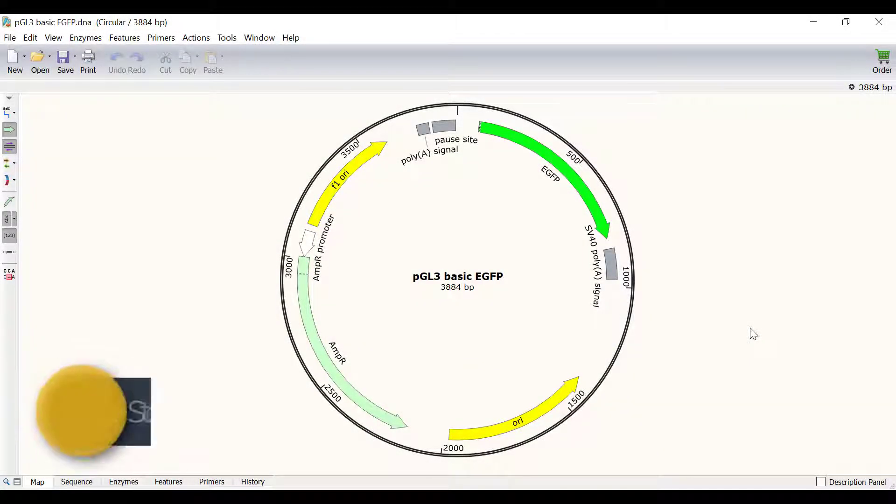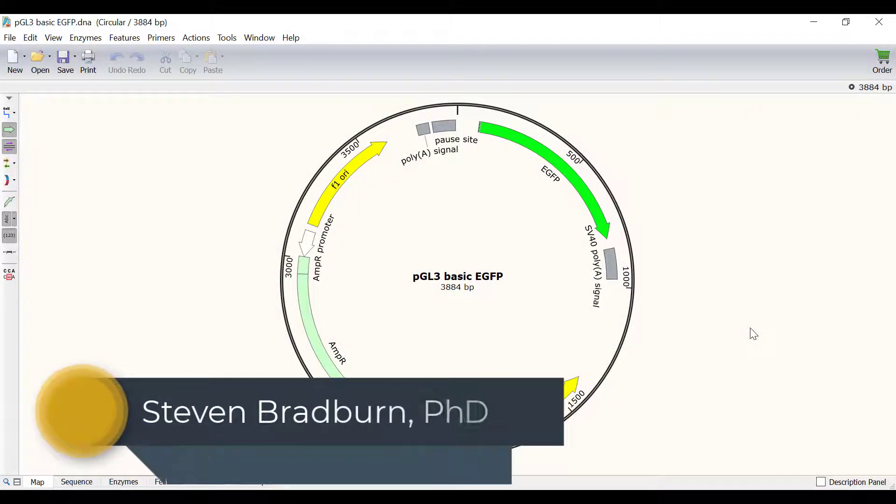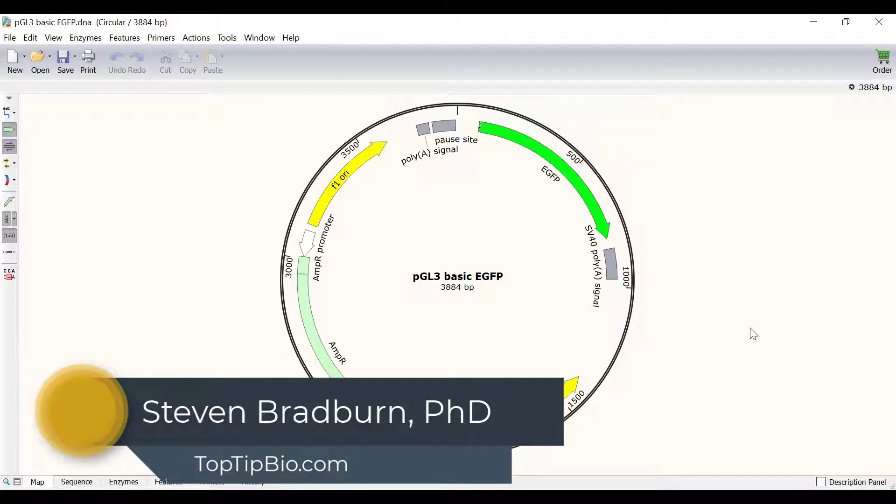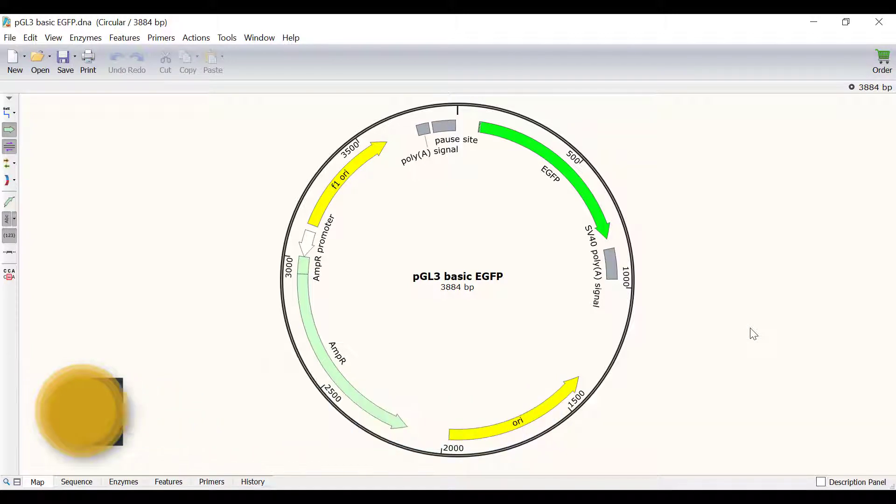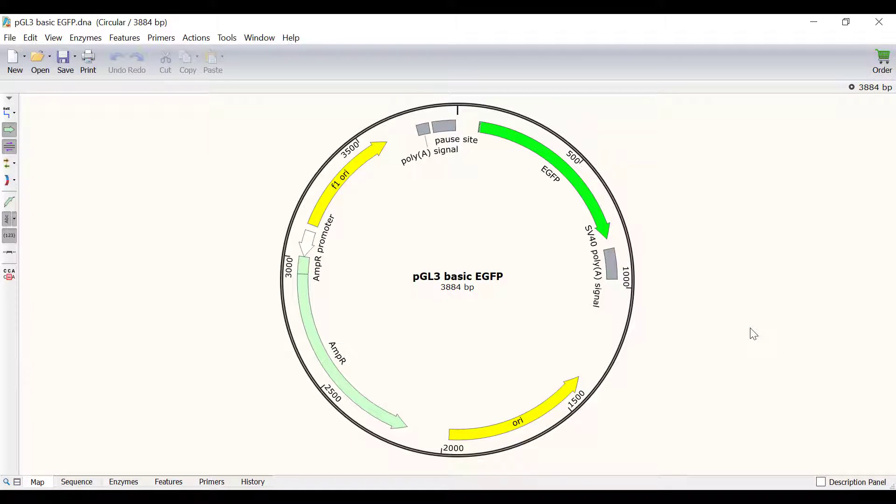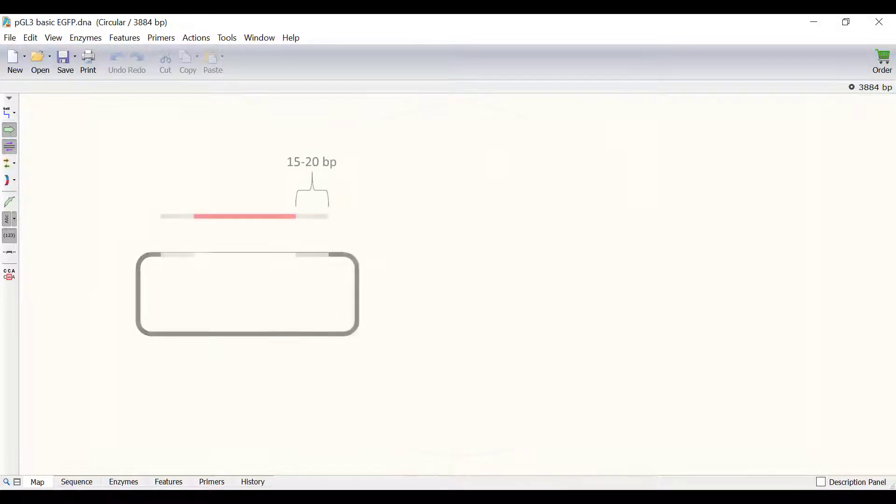In this video I will show you how to simulate Takara's infusion cloning with a single fragment in Snapgene. Infusion cloning is a ligation independent cloning technique that uses complementary annealing of an insert and a vector.